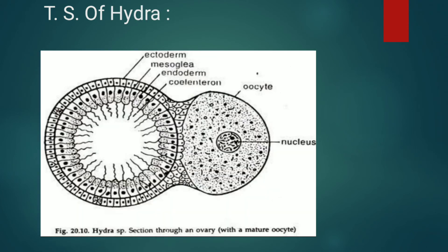Now we see the TS of Hydra. The body wall is composed of two layers of cells: an outer ectoderm and an inner endoderm. Between the two cellular layers there is a thin non-cellular mesoglea of jelly-like consistency. The ectoderm forms the outer epidermis and consists of epithelial muscular cells, interstitial cells, nematoblasts or stinging cells with nematocysts, sensory cells, nerve cells, and secretory cells.